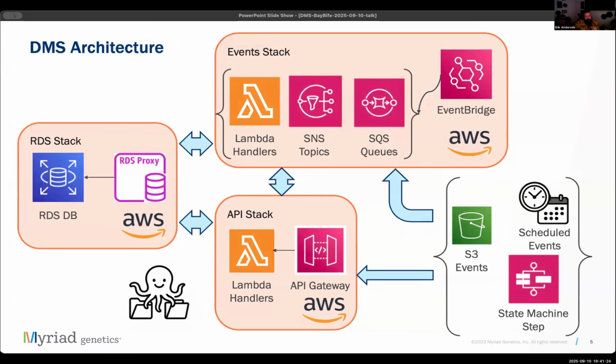So how do we achieve this? The DMS is built as 3 coordinated stacks: a database, event, and API. Like the state machines Malika described, the DMS is built using AWS CloudFormation. The RDS stack provides the DMS with its data backing, where all the information about managed data resides, using a relational database. The event stack enables the DMS to do things like perform scheduled operations, respond to changes in a monitored S3 bucket, retry incidental failures, and notify administrators if anything goes awry.